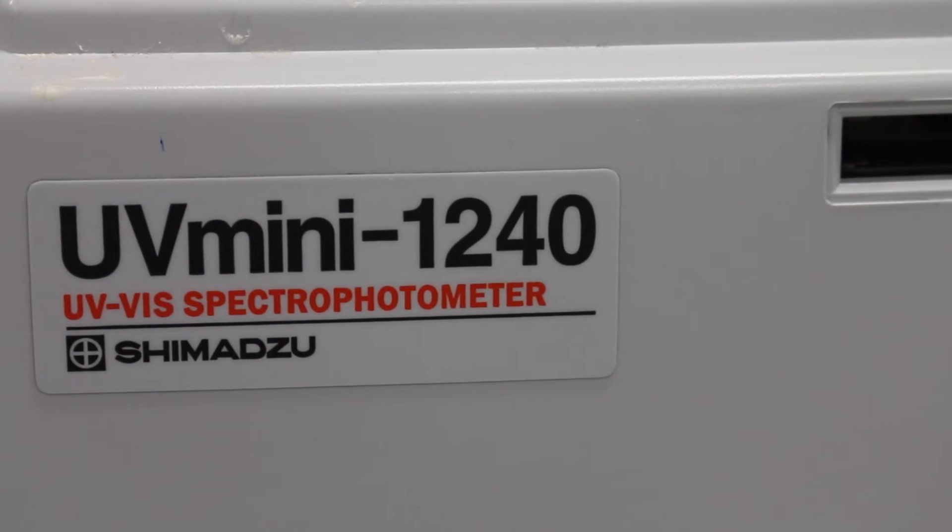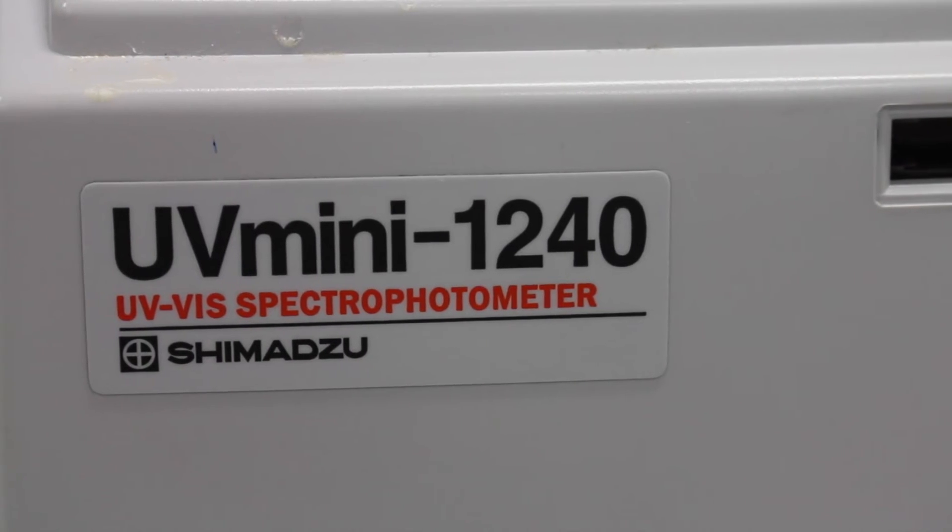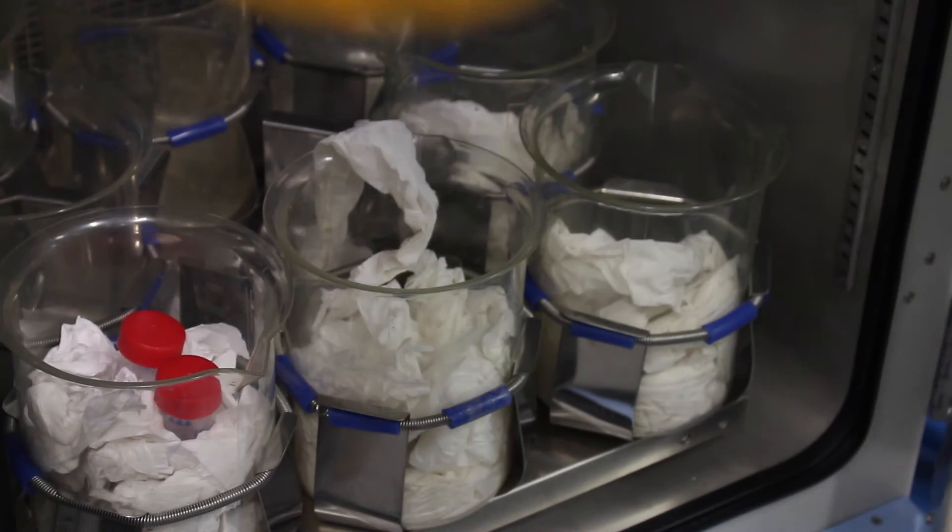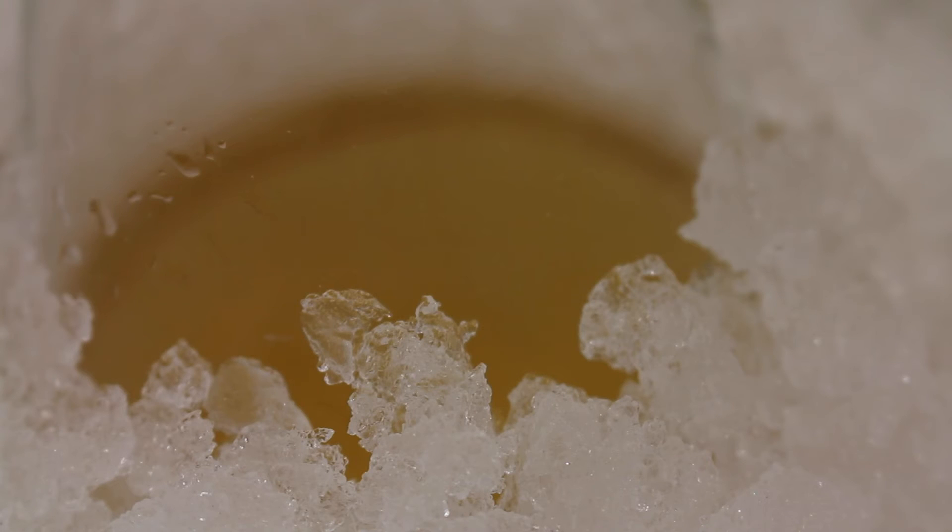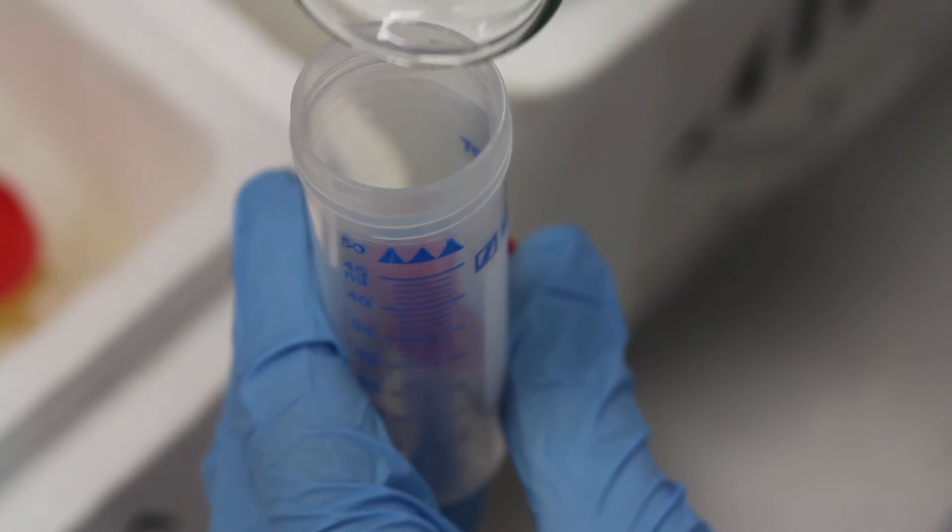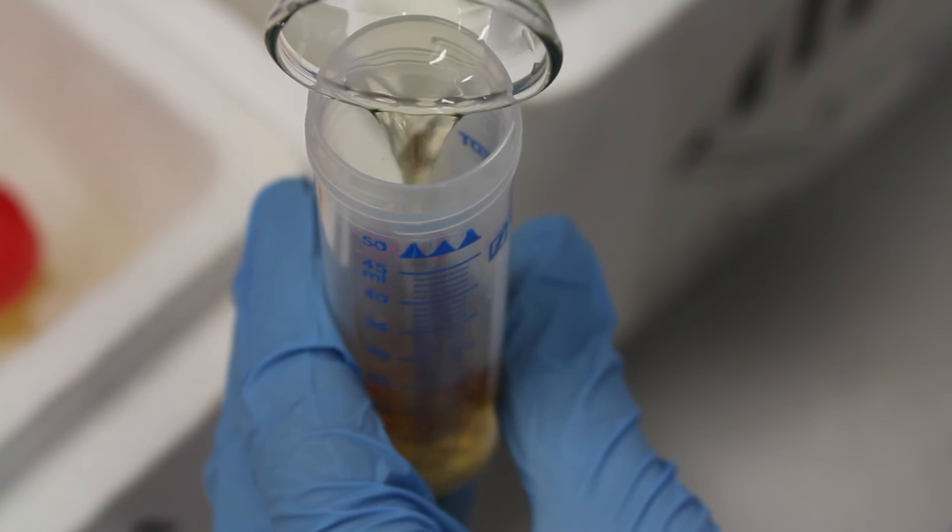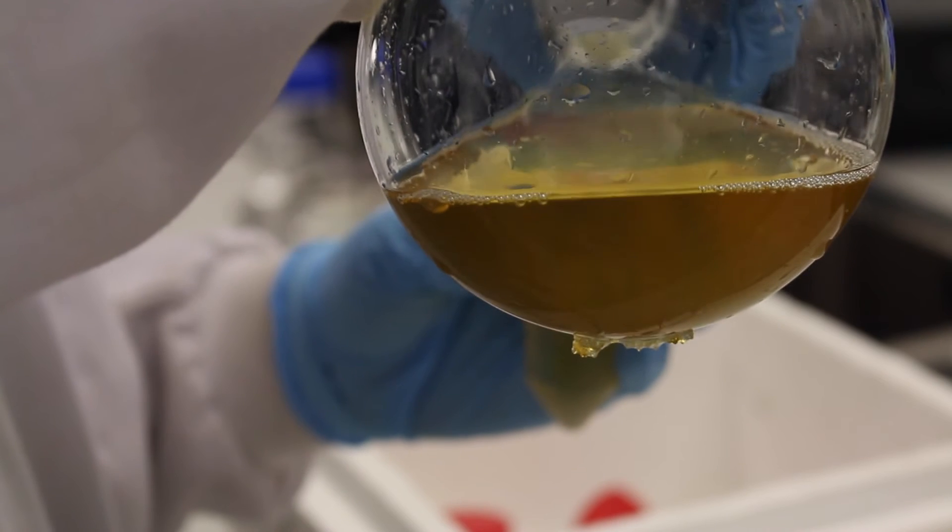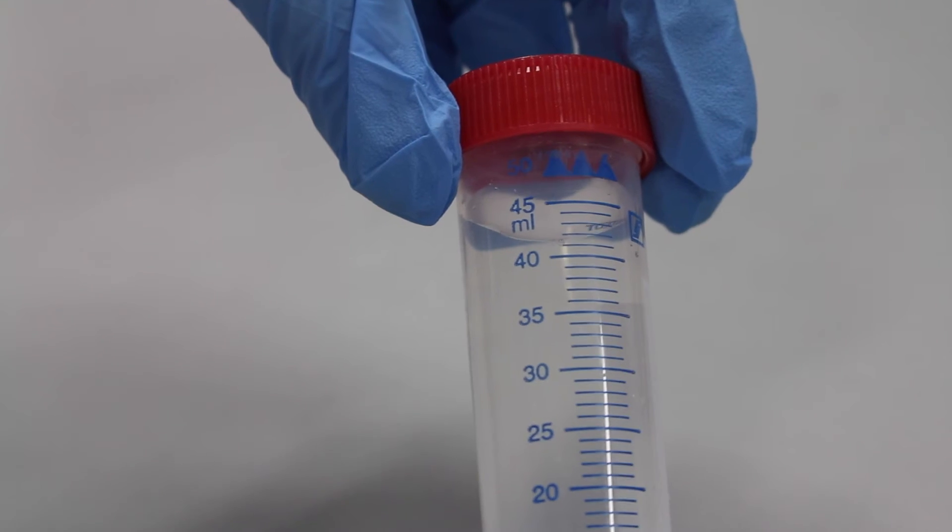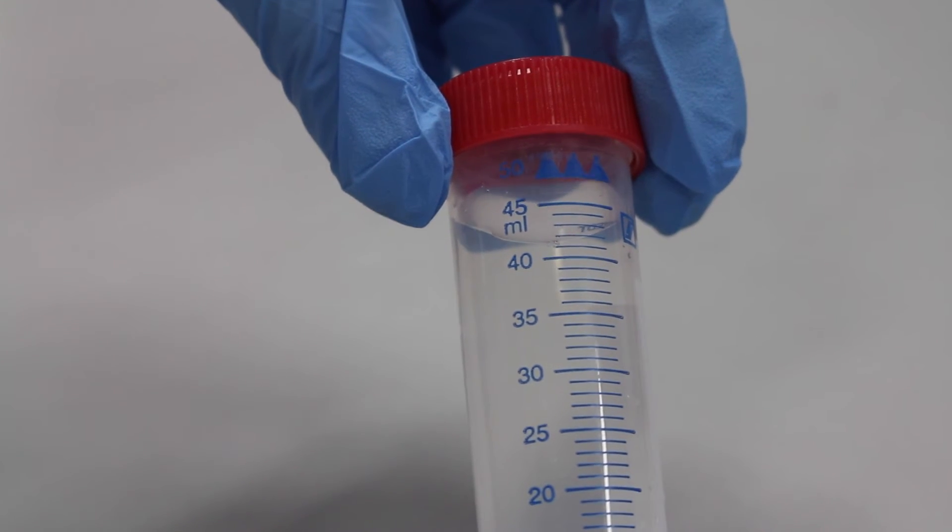Once the optical density is at or around 0.3, the culture is removed from the incubator and allowed to sit on ice for 15 minutes. The culture is divided between 5 pre-chilled falcon tubes by adding 50 ml of the culture into each tube. An additional falcon tube is filled with water and serves as the balance tube.